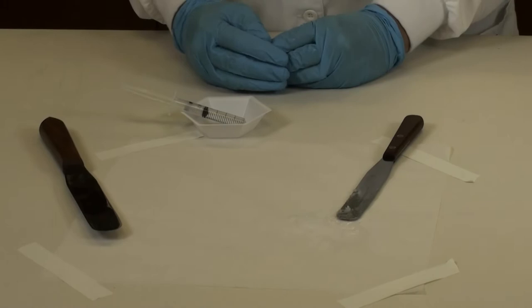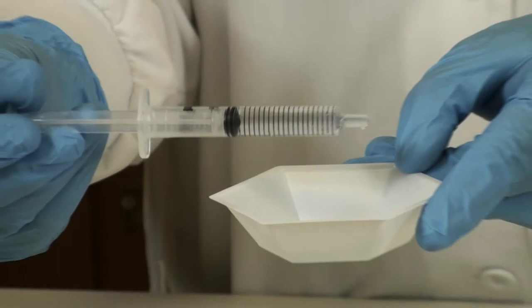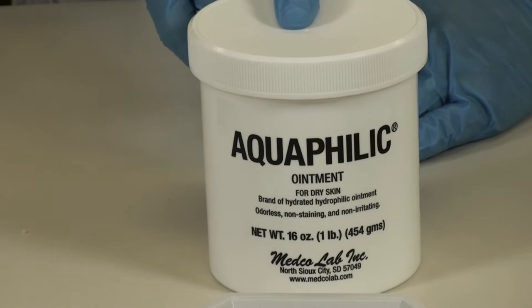At this stage of the procedure, you need to go ahead and examine the glycerin syringe and calculate the volume you used during the levigation step. After you've determined the volume of glycerin used, you can determine the weight based on the specific gravity. You can now calculate the amount of aquaphilic required for the prescription.